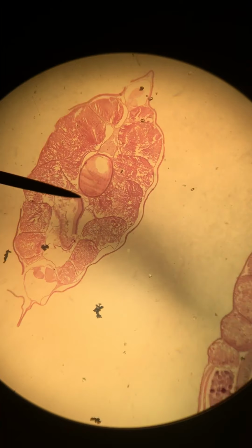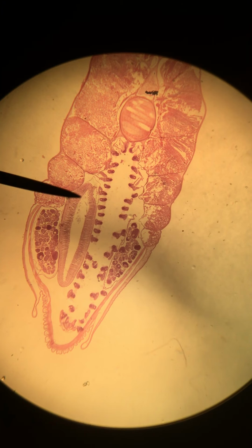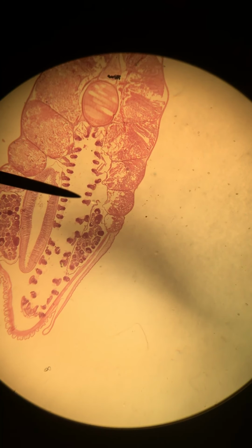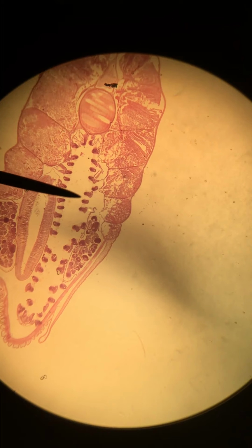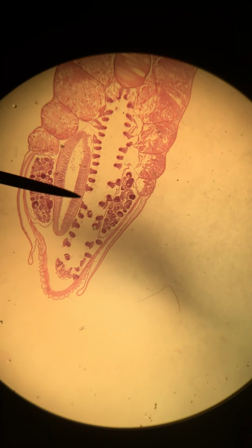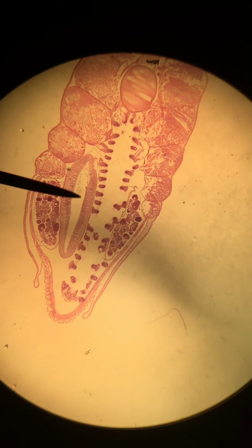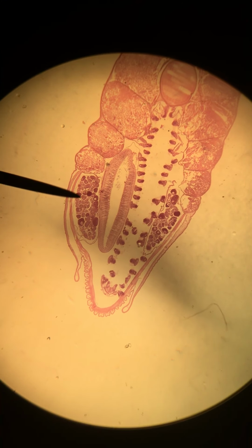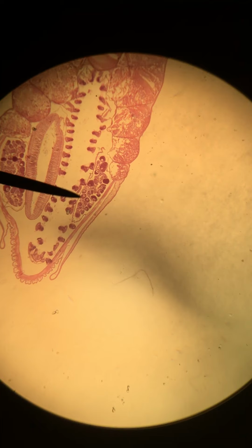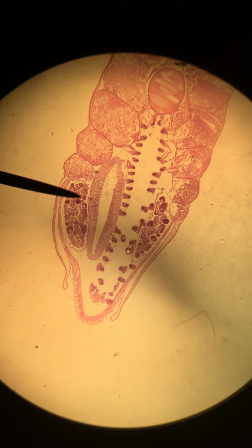Let's move to our next most caudal section. So this is sort of in the middle of the trunk. You can still see the pharynx here, this space here, but it has obviously been compressed a little bit to make room for some other structures. So this structure here, this is the hepatic cecum, and then you can see two similar structures. Here's one and one on the other side. These are the gonads, and in particular, these are ovaries.